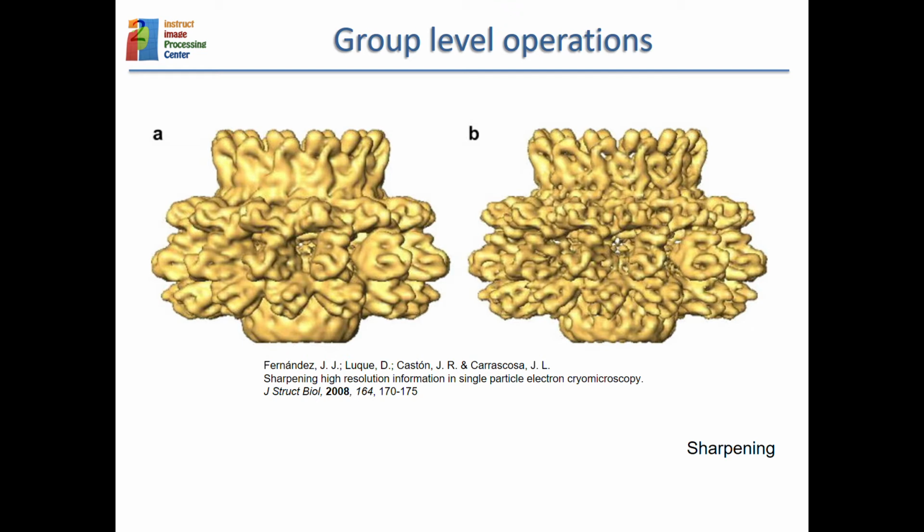There are many subtleties about what is the right amount of sharpening and why you should do sharpening, and there are many issues there. But many of these sharpening operators can be thought of as kernels that are convolving your image with the right weights in each one of the pixels.